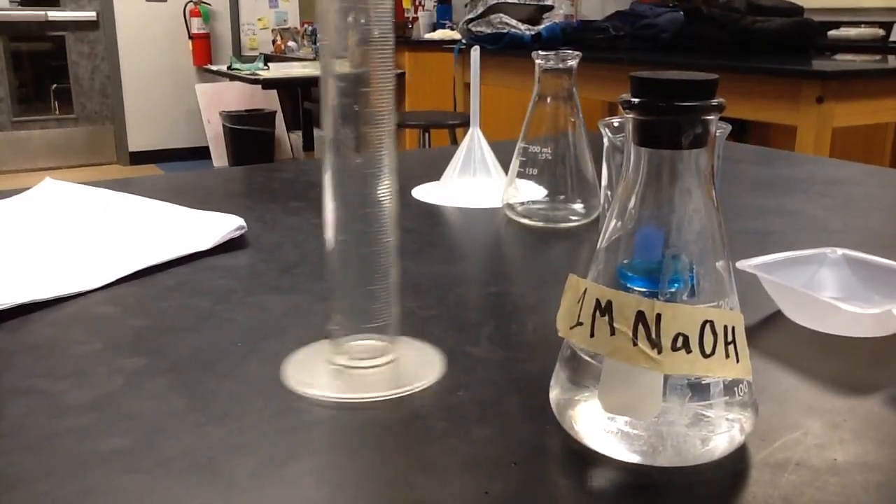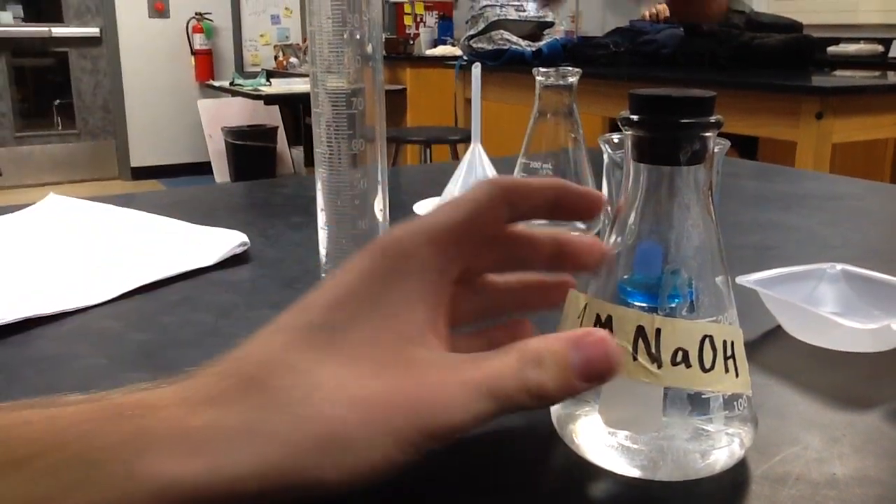Do the same step with the sodium hydroxide, but this time make sure the sodium hydroxide is at 50 milliliters.